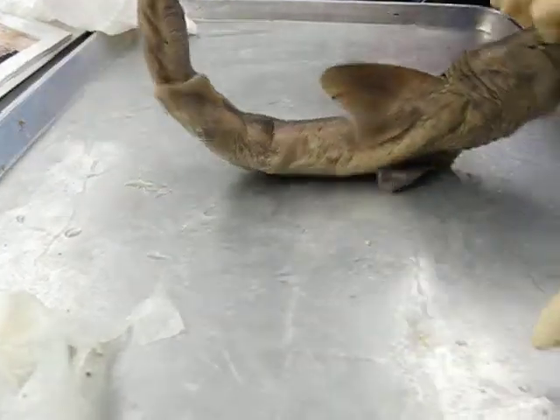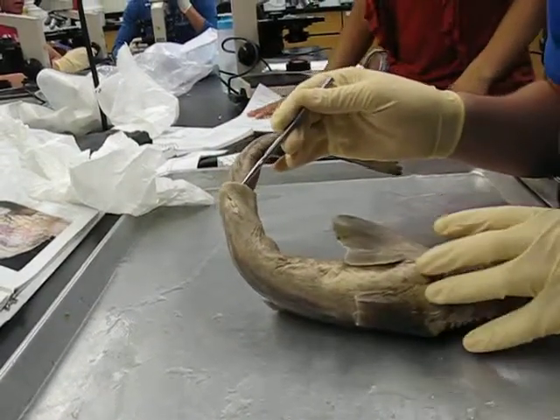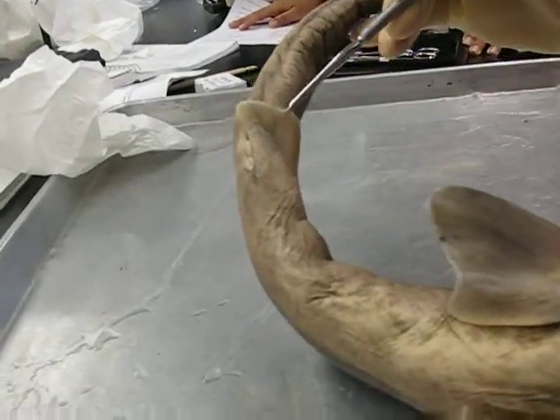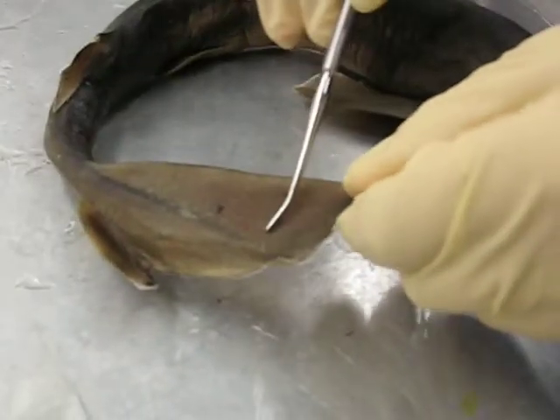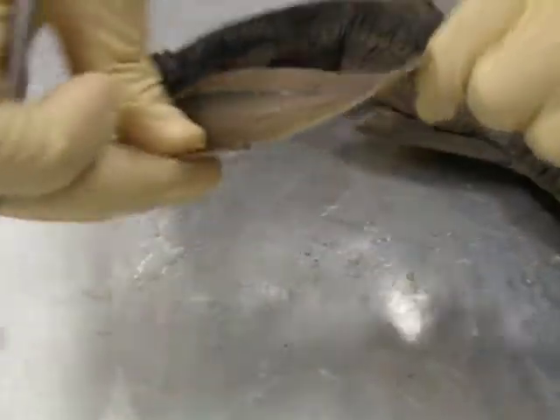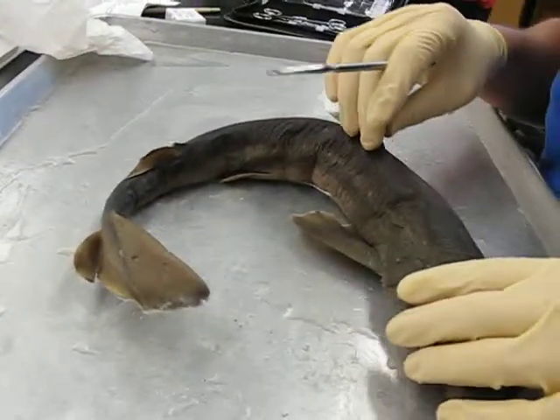The pelvic fin is under here — there's no clasper because it's female. The dorsal lobe of the caudal fin is this, and then this is the ventral lobe of the caudal fin underneath. And that's it for the external.